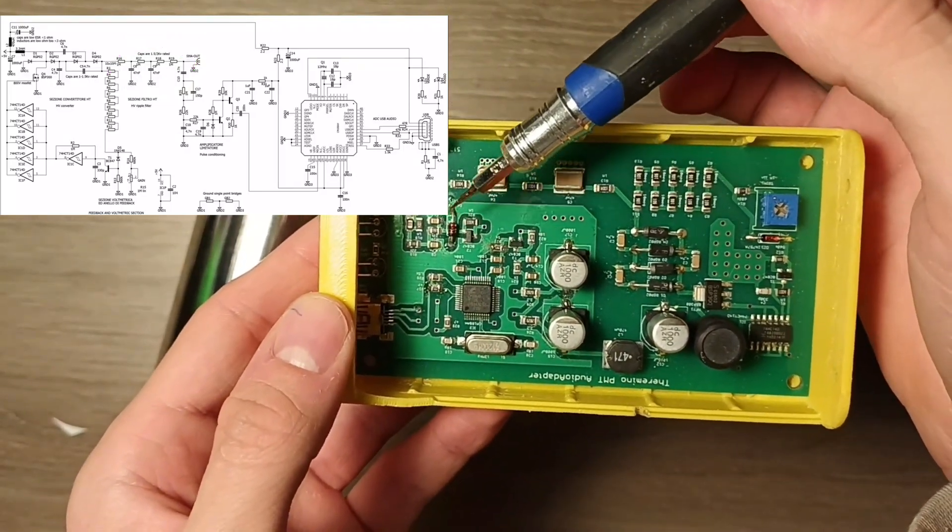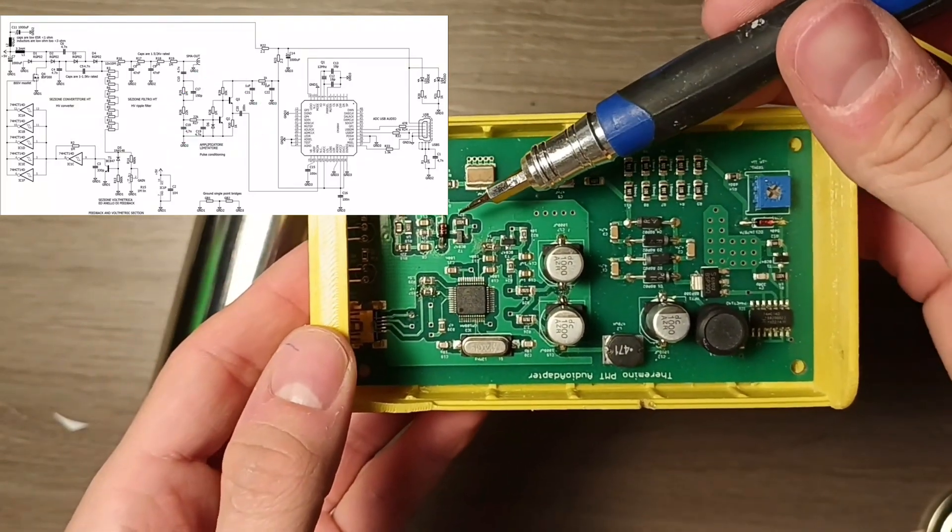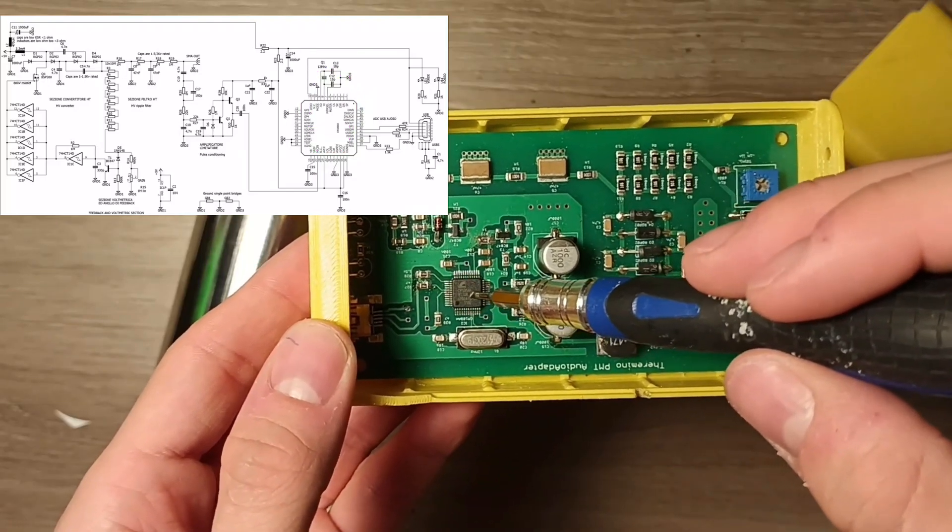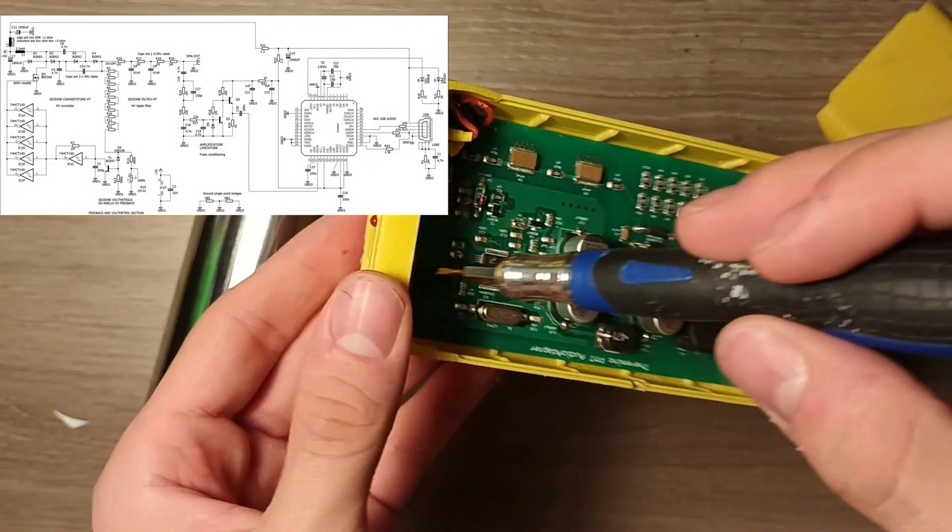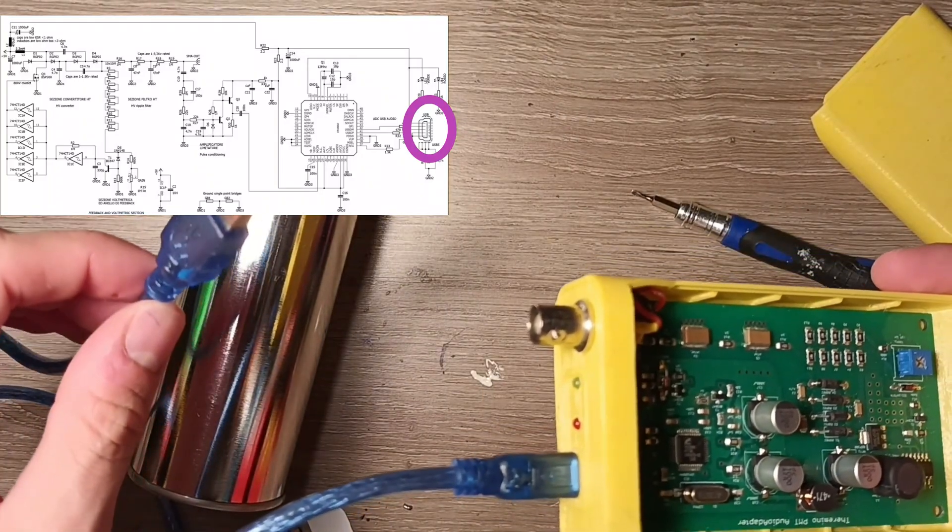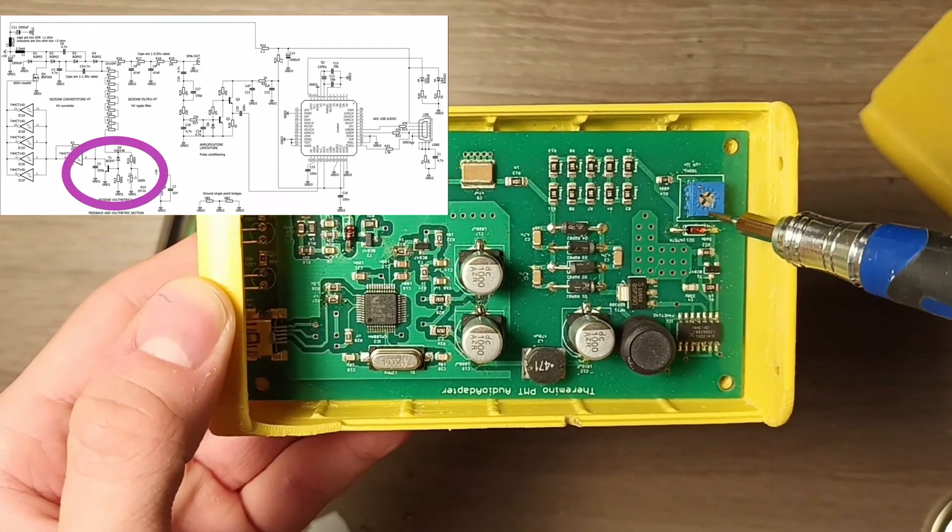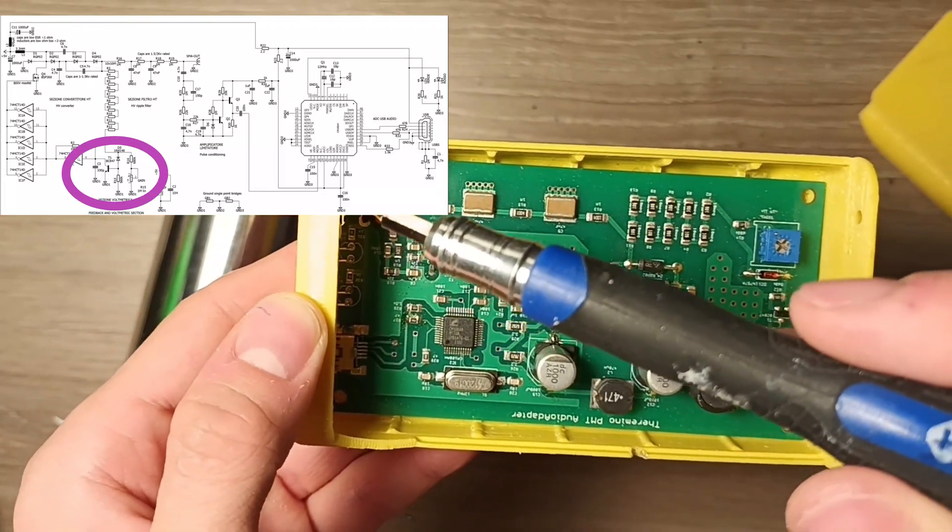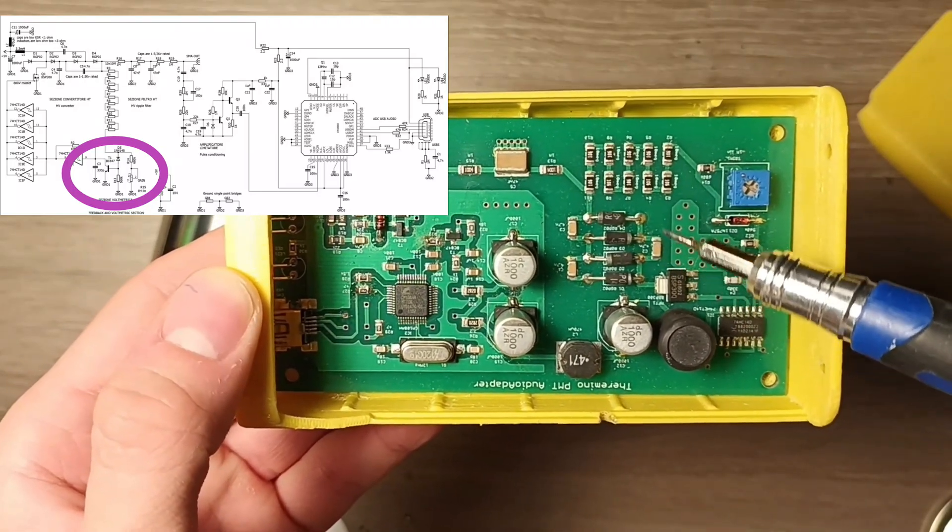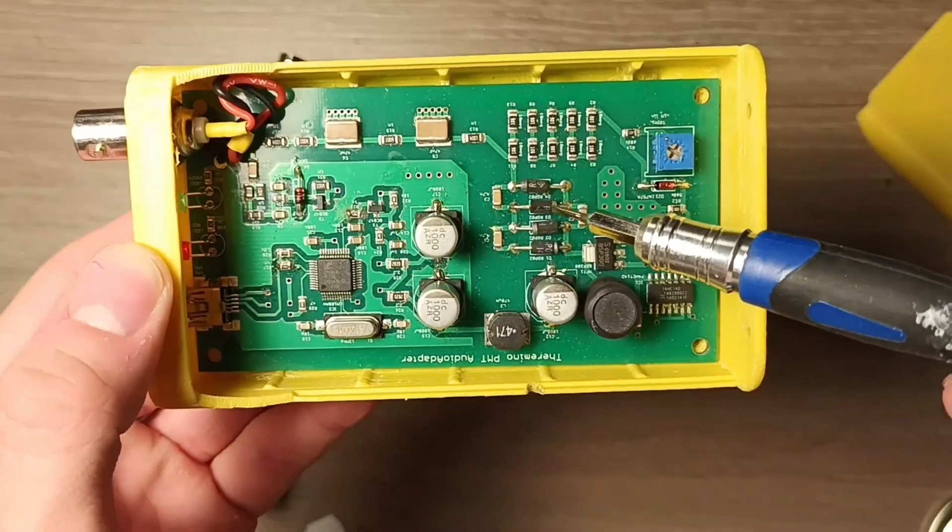This part instead is the signal decoupling which takes out the pulses that come on the high voltage line and transmit them to the signal processing unit here, which transforms the pulses by integrating them and they are converted into a signal which is then transferred to the PC via this USB cable through a normal audio signal that the sound card of your computer can read. Here on the right instead you can see the voltage divider for measurement and stabilization purposes and the high voltage generation circuit which uses a high frequency inductor that is oscillating, and this potentiometer allows to regulate the high voltage coming out of the RC filters. Down here you can see the full bridge rectifier for the high voltage.